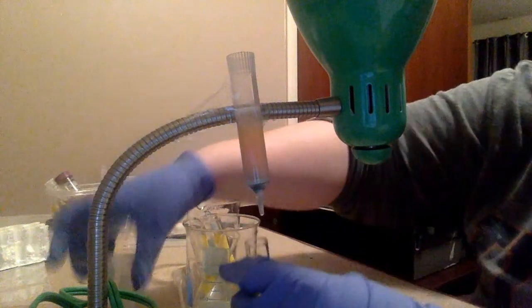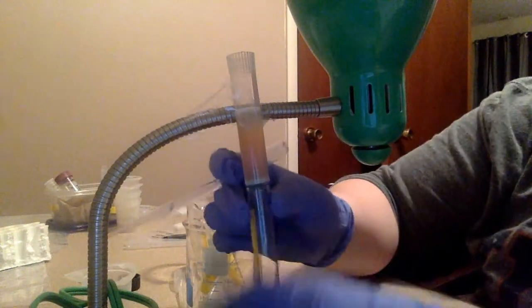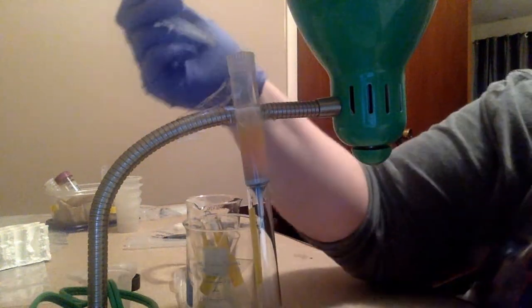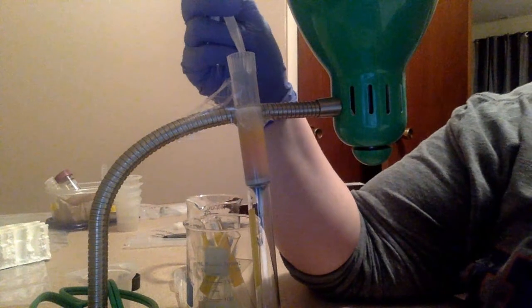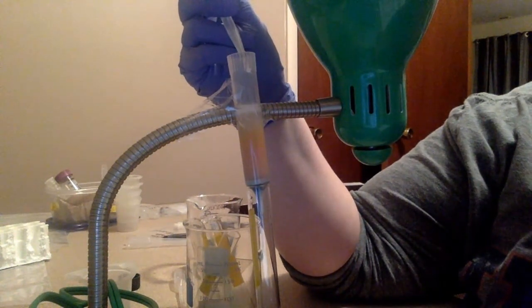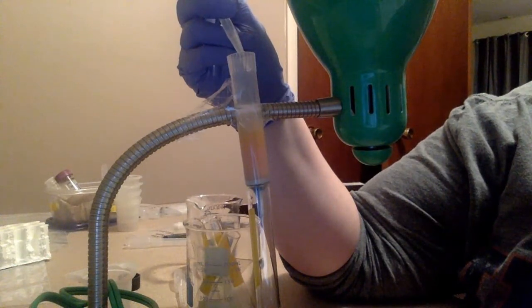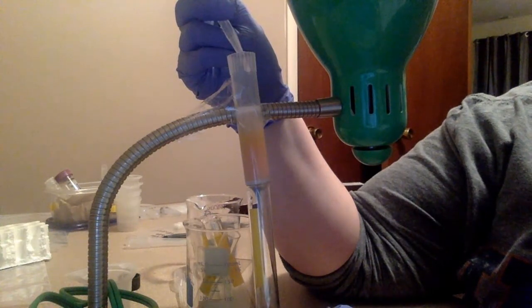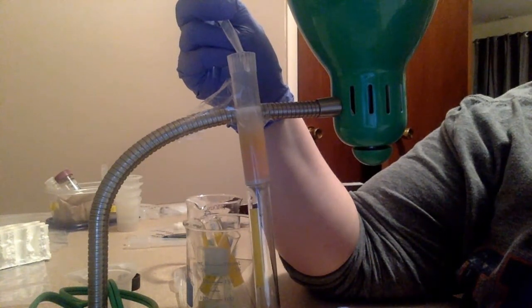so I'm going to switch over to this test tube here, and I'm going to use this test tube to collect my blue color. And my goal is to collect only blue here. So as soon as I see the blue stopping, I want to quickly transfer over. And as we can see, this is going to be quite a quick shift here.